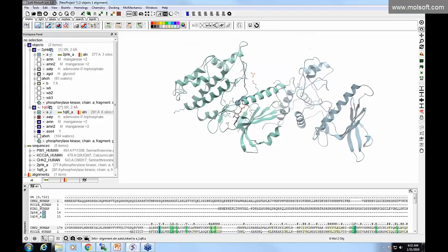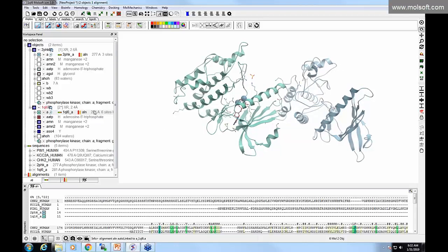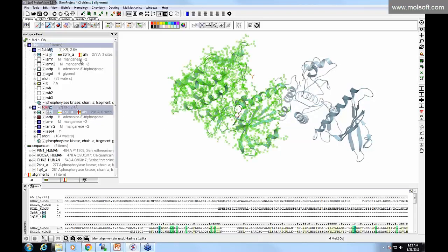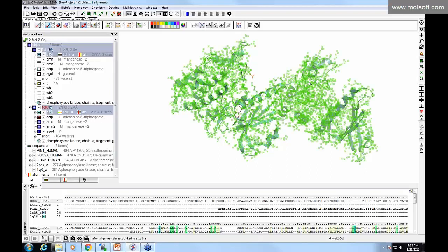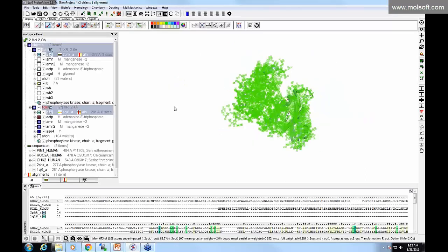So we need to superimpose the two pockets. We've shown this before in previous webinars, so you can go back there. But a convenient way to superimpose 2 protein structures is to double-click on one here in the ICM workspace, make a selection, and double-click on the other here. Go to the Display tab and click on Superimpose. That superimposes them.